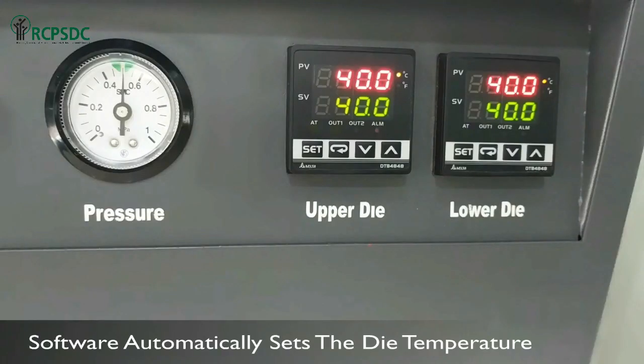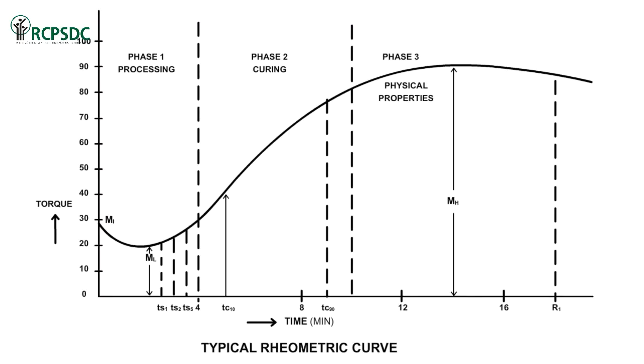Please ensure that pressure and die temperature is maintained throughout the test. A plot of measured torque value over time produces a typical curing curve. From the curve of torque versus curing time, all vulcanization characteristics of the rubber compound can be determined directly.